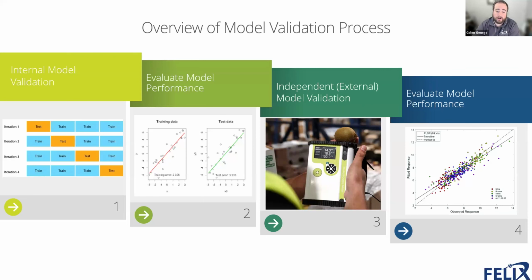Those methods are like the holdout method, where you're essentially just withholding a subset of your data and testing it against your training data, the rest of the data in your model. And then there's also something like the k-folds cross validation, which is essentially the same as a holdout validation, but done repeatedly with different subsections of your sample set, your test or your training set. And then that is repeated multiple iterations, and from that you get an average of your error in your model.